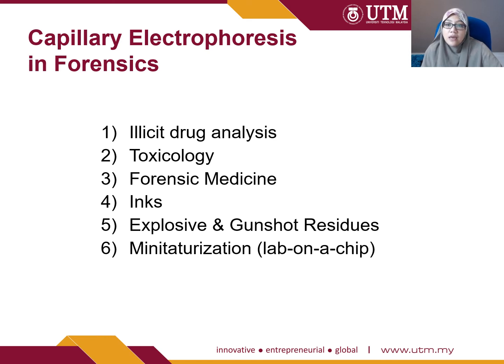Okay, and lastly, in miniaturization or lab on a chip, as it is named, it can cover all separation techniques, because nowadays people want to do analysis directly, especially on-site, right? In forensics, a lot of miniaturization or lab on a chip analysis using capillary electrophoresis techniques has been done. So we'll discuss a little bit on this later.